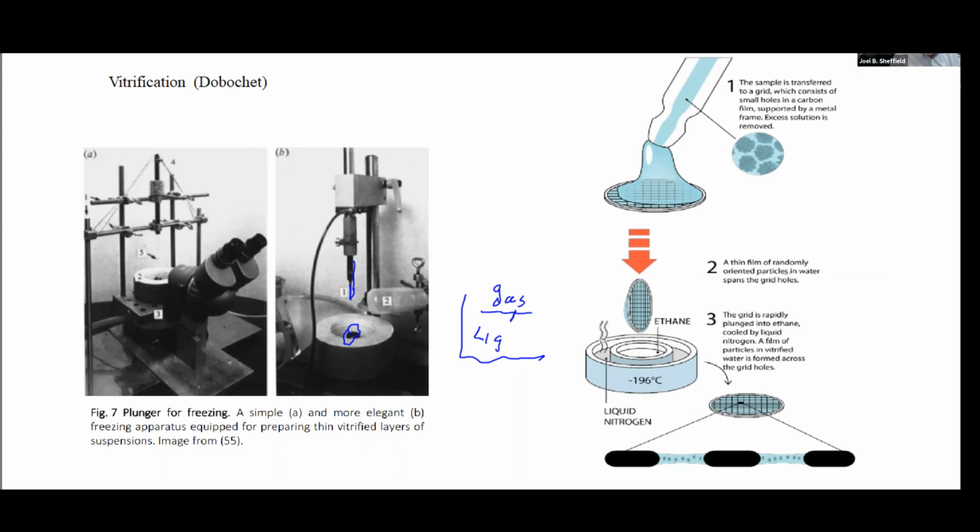And generally, this transition is very, very quick. So that as soon as something enters the liquid, it almost immediately turns into gas, and the gas ends up insulating what you're trying to freeze. So the way around that is to have ethane, which will not be at the edge of its liquid-gas interface, but will be seriously in the liquid when you add a sample to it. So the sample is frozen in liquefied ethane.